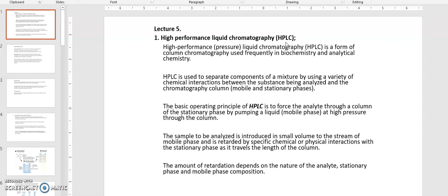However, HPLC is also used a lot, especially for the purpose of qualifying and quantifying your target protein molecule. Instead of purifying it, you're using HPLC to quantify and qualify. So HPLC is used a lot in your QC analytical methods.